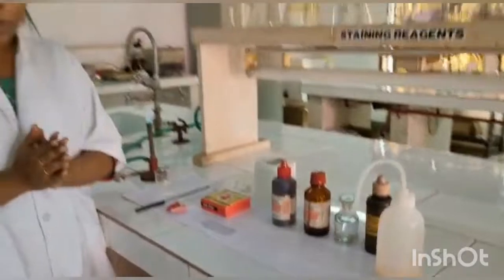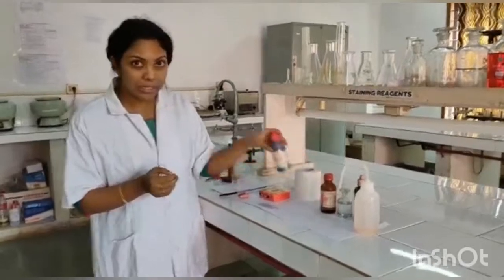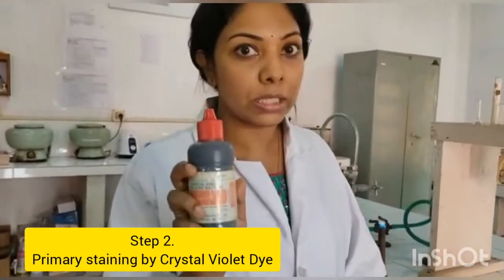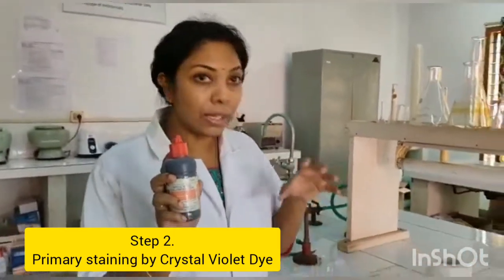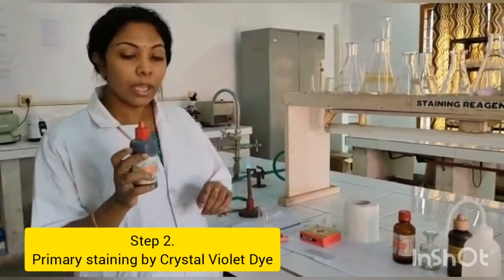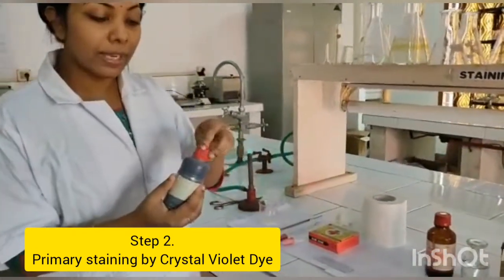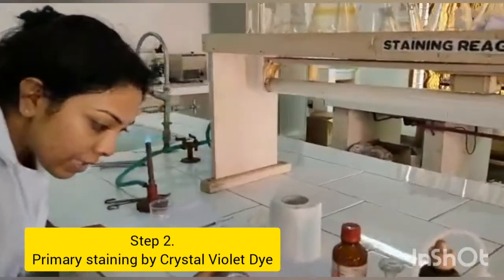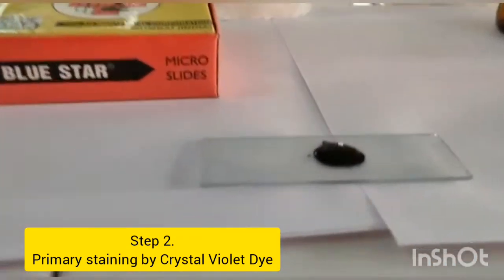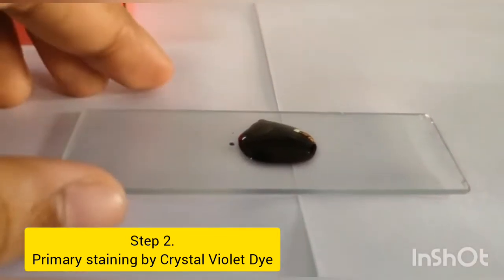I already told you the basic step starts with the application of the crystal violet dye. So we have the crystal violet dye. After cooling the bacterial smear, we will be applying the primary stain, crystal violet. We'll cover the smear with this crystal violet dye for 1 minute. The time should be noted. So 1 minute of crystal violet dye should stand over the smear.